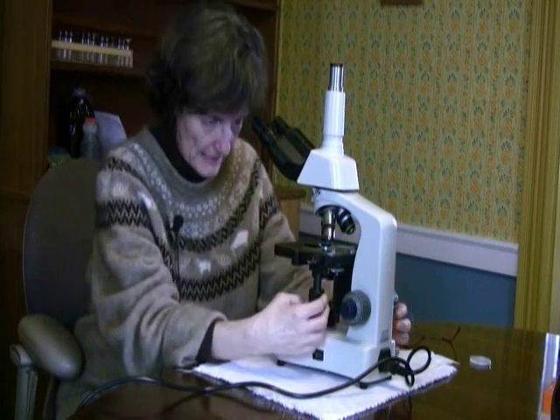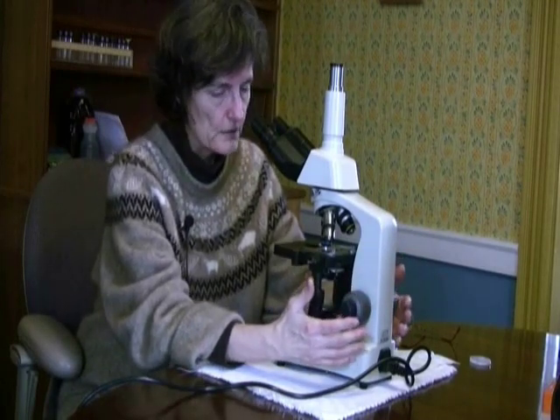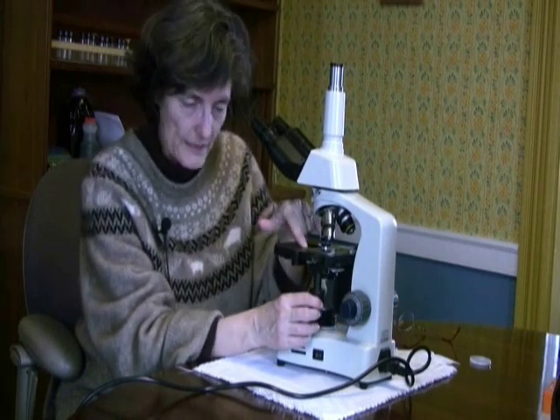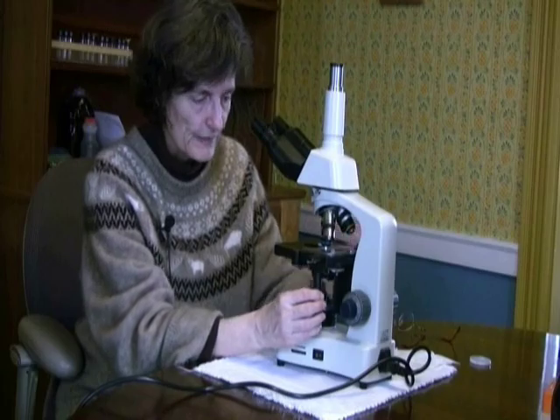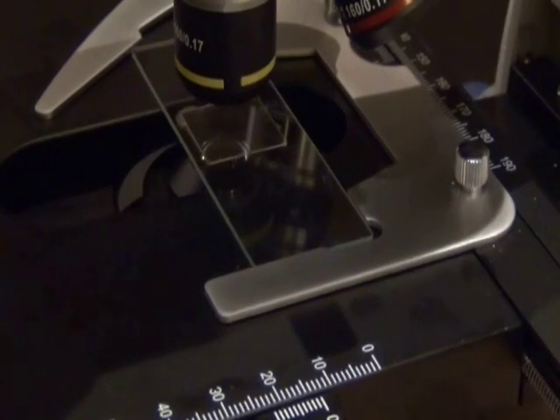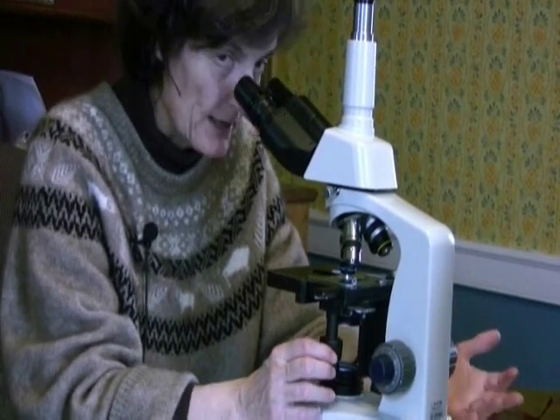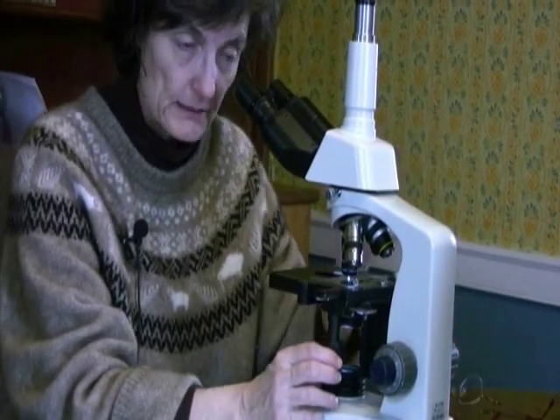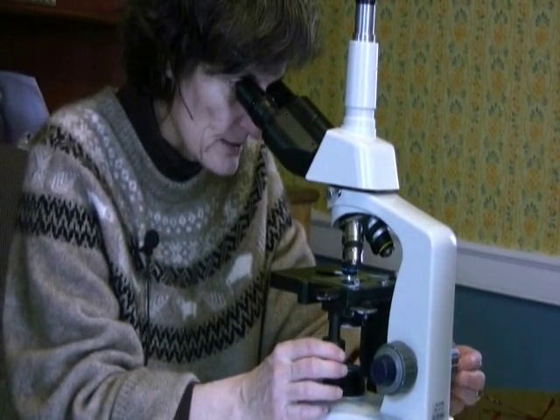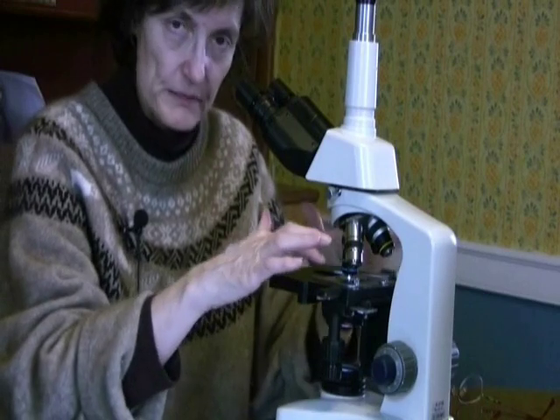When we're looking at the stage, you of course have to have a stage that you can focus up and down with the coarse and fine focus, but then you also want to have a stage where the microscope slide sits in a holder that moves easily front and back, side to side, so you can very finely, very easily move this very short distances, especially when you're trying to find a ciliate that went zooming across your field of view and you want to be able to follow it and see where it went and what it's doing. You really need to have the ability to finely control the movement of the slide.